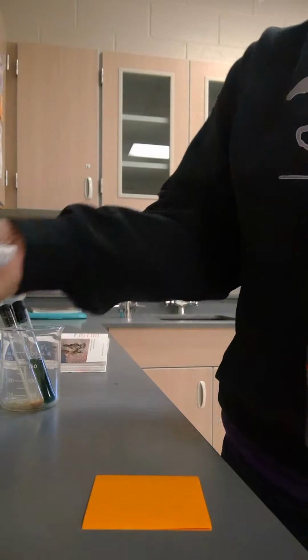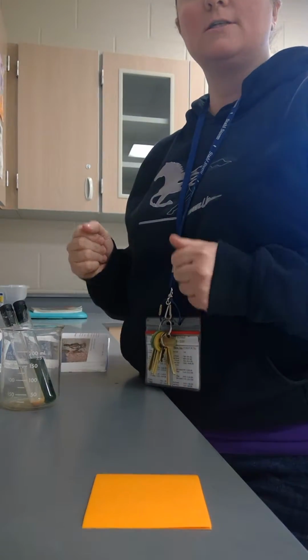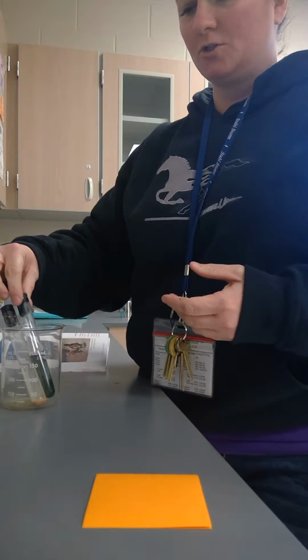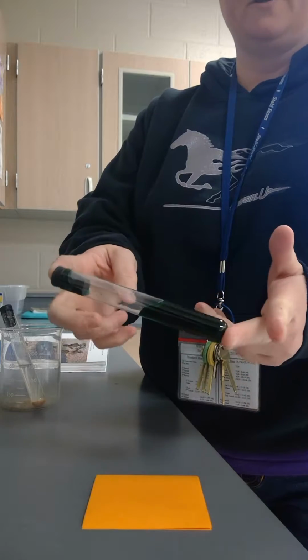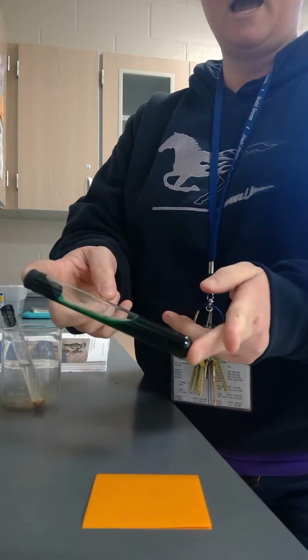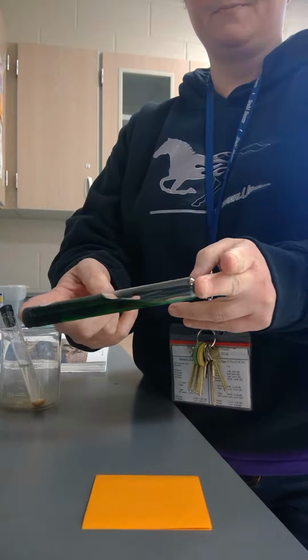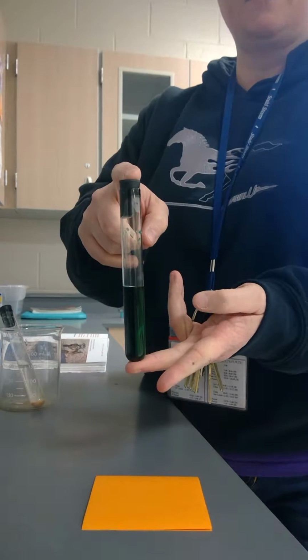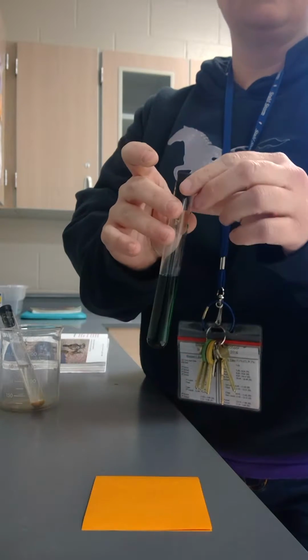So to observe means to what? To see, to look. So this is your first substance to observe. In this test tube, I have food coloring and water. So there are some properties of liquids that you should identify.